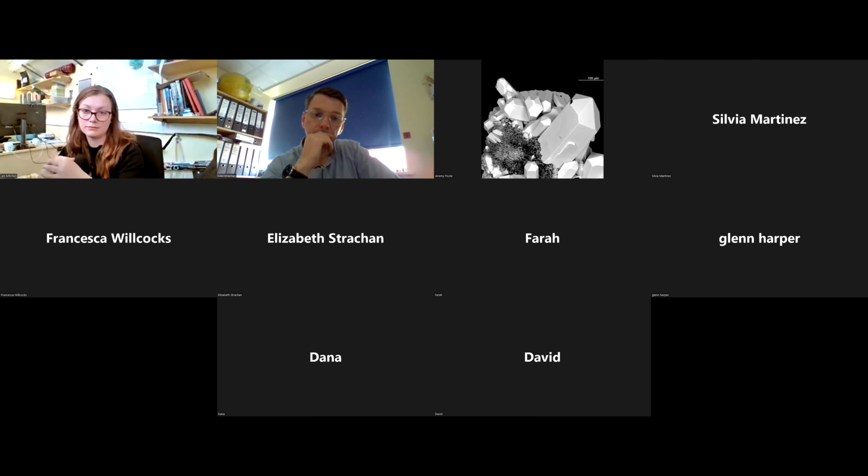Thanks. And what happens if you coat with gold? You will measure gold. And nothing else? Not really, no. You'd have to put so much power into the sample to get through the gold coat. Because gold's quite heavy, it's going to suck up a lot of the X-rays. So EDS is a carbon coating technique. I feared as much. Thanks very much. That's right.